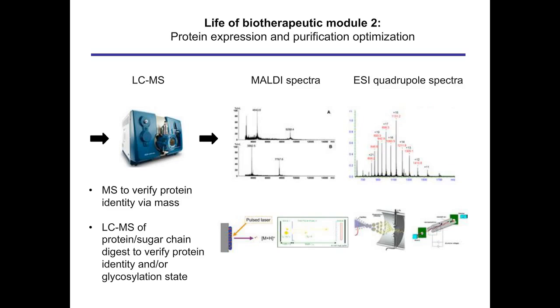And in this case, the charge state of the proteins or peptides is related to the number of positively charged amino acids, such as arginine and lysine, and it's usually conducted under very low pH conditions so that all of the carboxylates are at that point neutral.